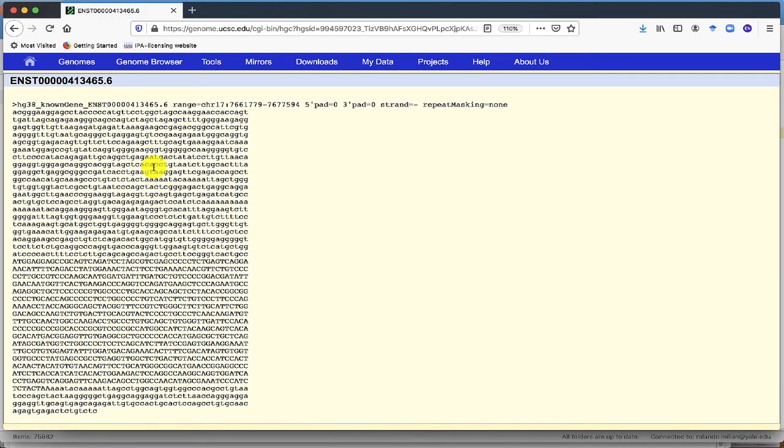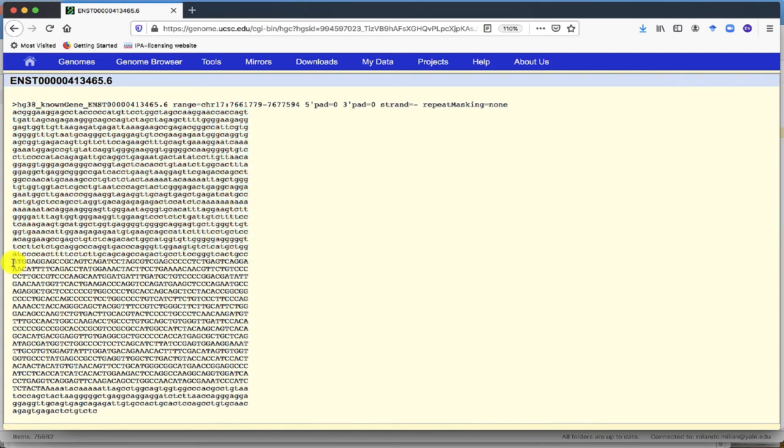And here you have your sequences, UTR sequences in lowercase, exons sequence CDS in uppercase.